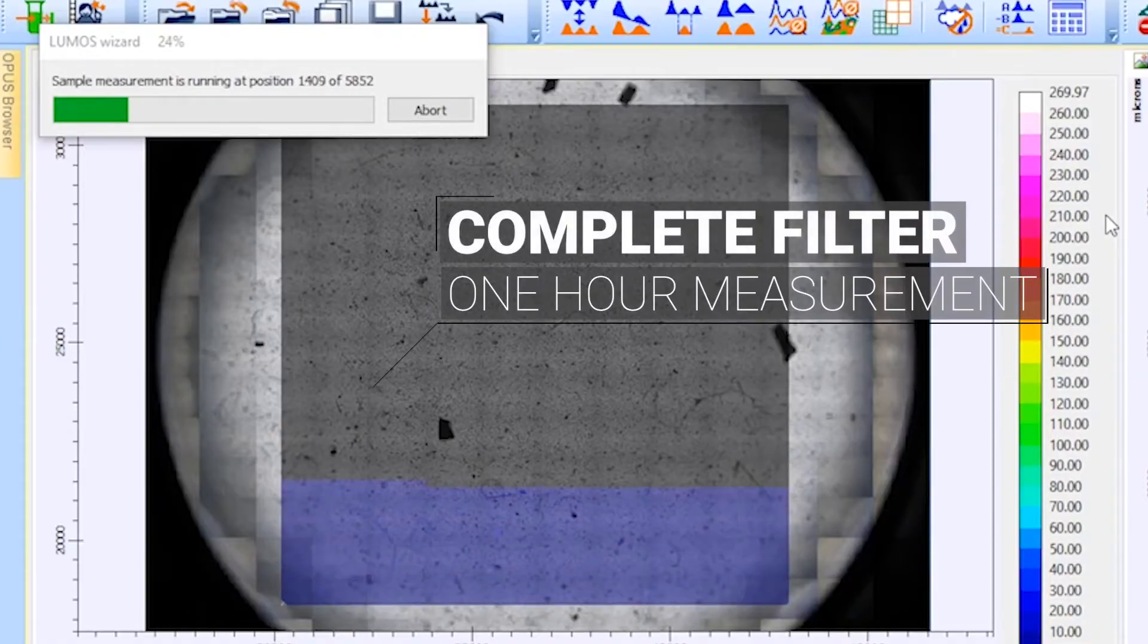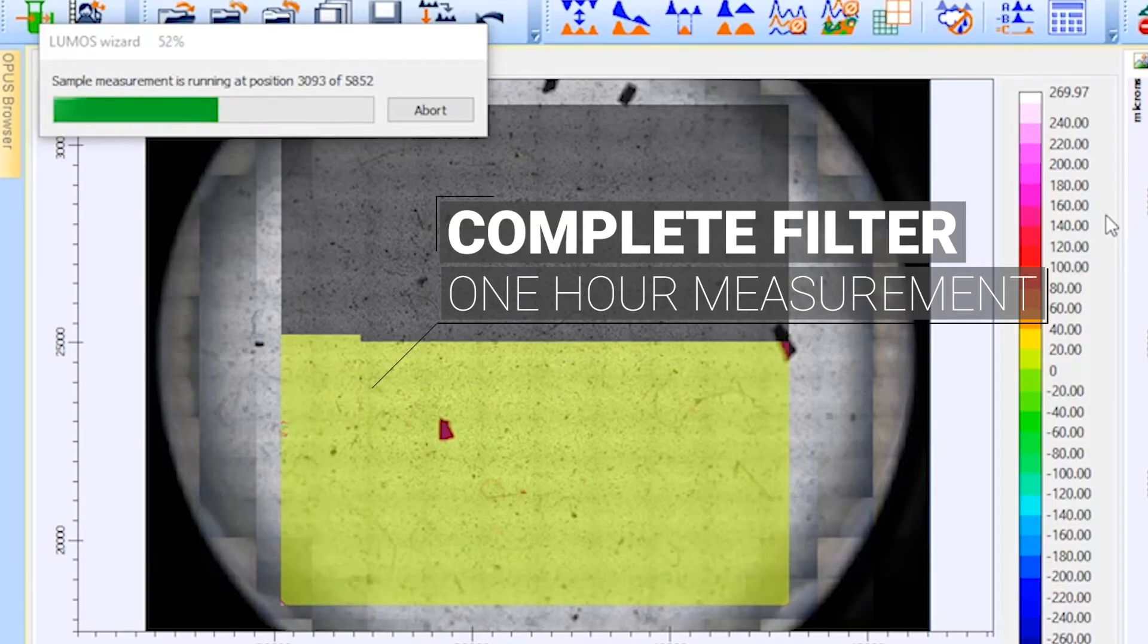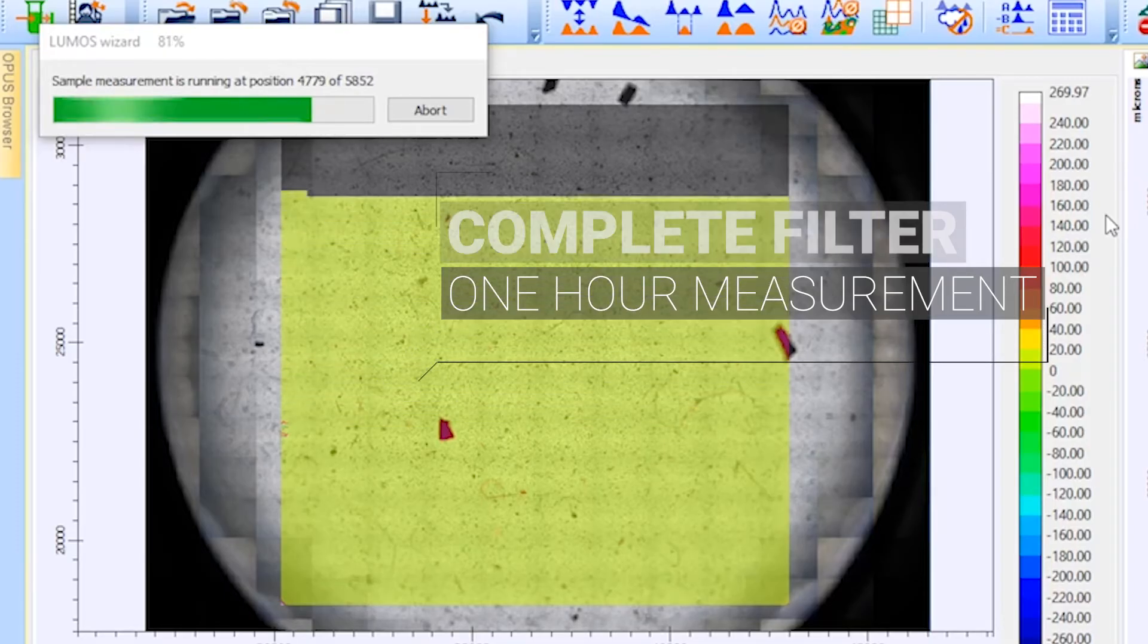Let us look at facts. The Lumos II only needs an hour to analyze a complete 10 by 10 millimeter filter. With that, focal plane array imaging outperforms FTIR single point and Raman imaging measurements by at least three orders of magnitude.